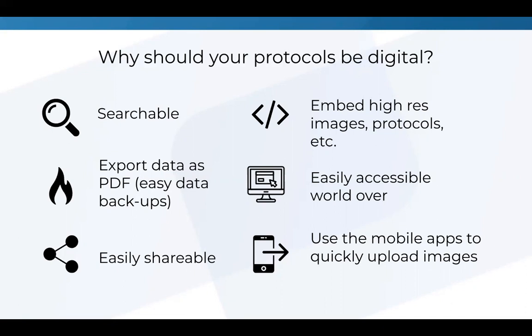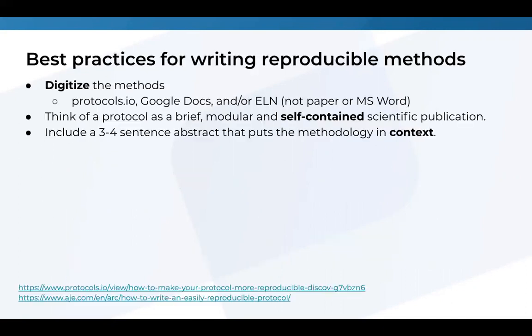So I really encourage you to not only have them on paper lab notebooks. If you do still like to have paper lab notebooks, I guess that's okay, as long as you have the important stuff digital as well.